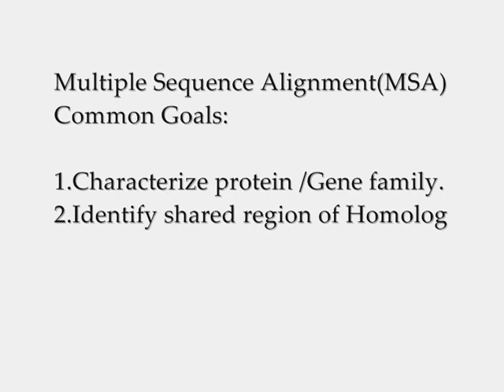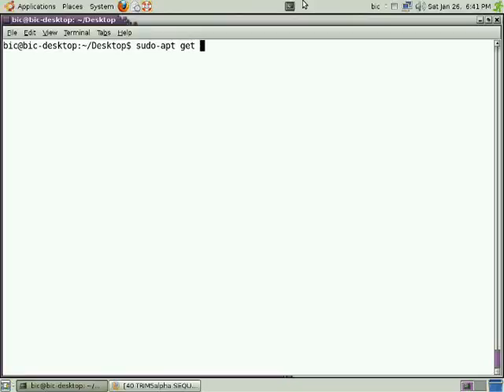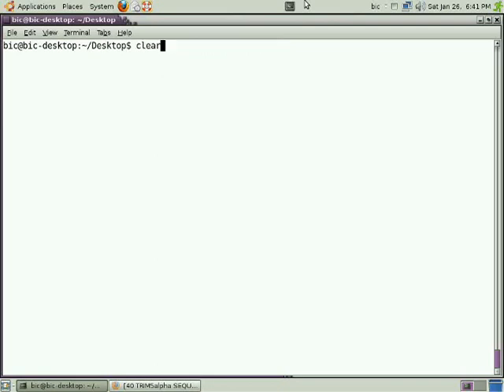This often happens when a user has to run a BLAST or FASTA type search of sequences in a database. ClustalW needs to be installed on your system. I already have it, so I don't need to do that. After you finish the installation, you enter the program just by typing 'clustalw', the name of that program.